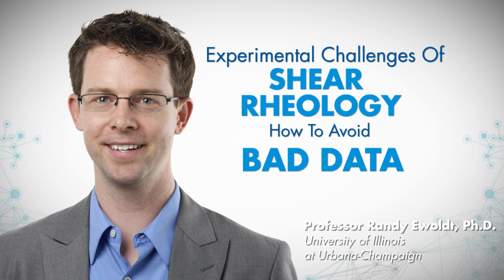What else? Gosh, this is kind of a gray area that probably depends on your operator and what you think they may or may not be doing with the data. It's hard for me to think of exactly what goes on. I mean, if they fall asleep and they didn't look to see that at high velocities all of your material was flung out, and then they woke up and never mentioned it to you, I think that you could still ask for similar things that I mentioned during the talk today, things like making the measurement at a couple different gaps, or just repeating the measurement, of course.